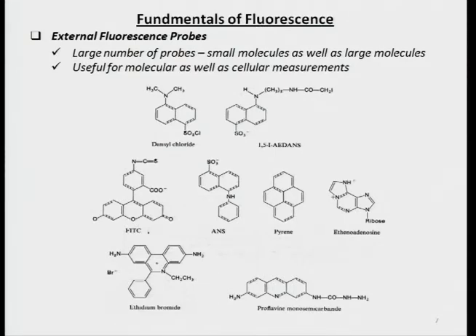And these are just a spattering, some things that I could quickly put together. But obviously this is just such a small number. In fact, there is a company that sells a large number of probes all over the entire wavelength spectrum. So for example, dansyl chloride or FITC or ethidium bromide, all of these are very useful.